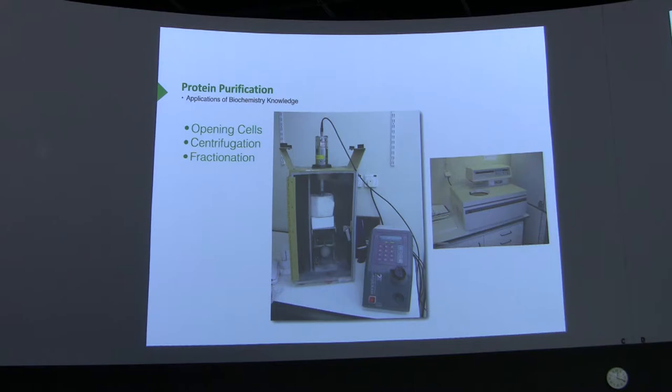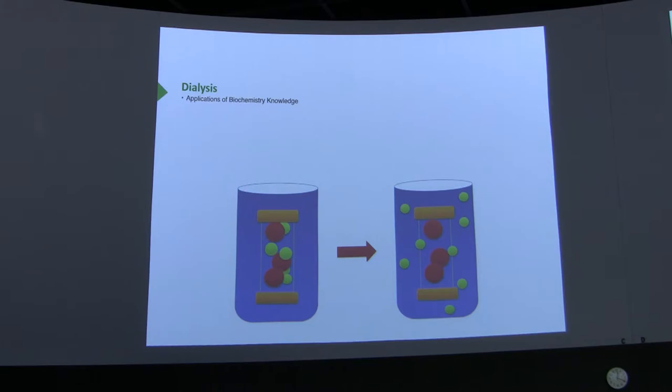One of the most simple techniques that we work with, and it's a very common one, especially as we are working with proteins, is dialysis. Dialysis, I'm sure you've done this in biology labs, typically involves a tubing or membrane that is semi-permeable, meaning that some things it lets pass through, other things don't pass through. And this schematically shows a dialysis, for example.